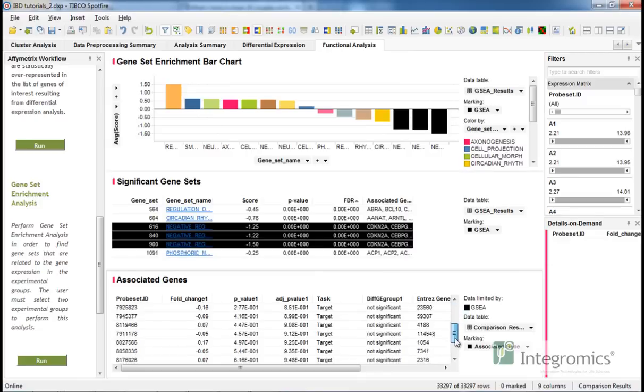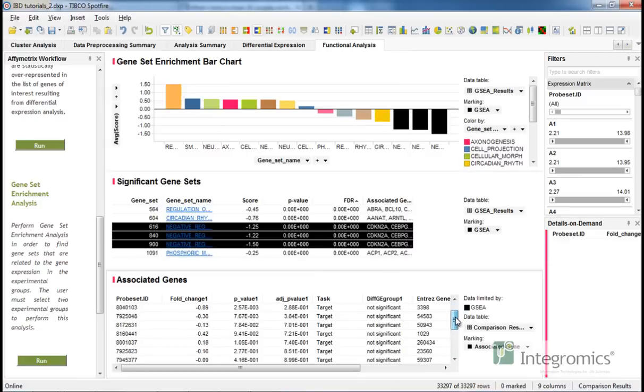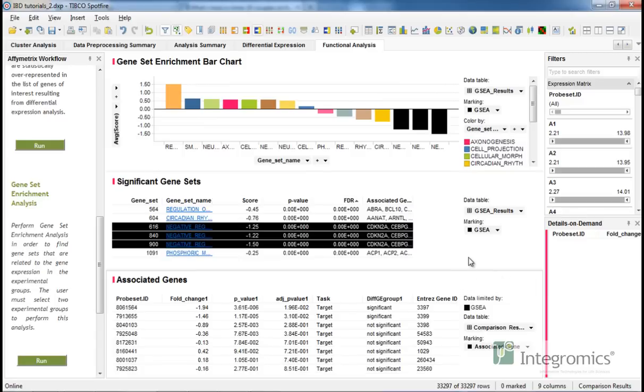This table can be based on the comparison results if differential expression was performed before geneset enrichment analysis. Otherwise, it will be a separate table holding all probes of the arrays and the corresponding gene symbols.